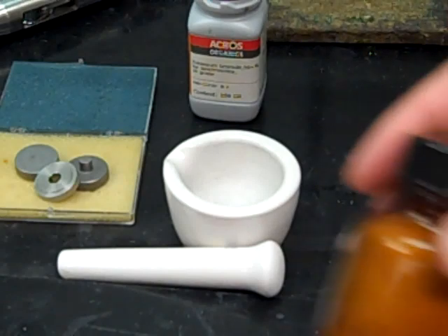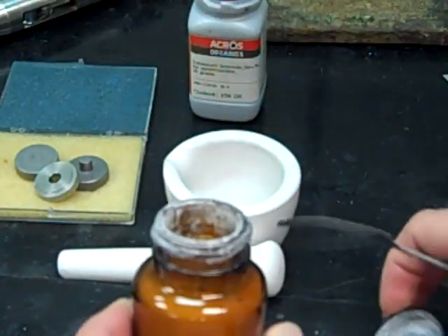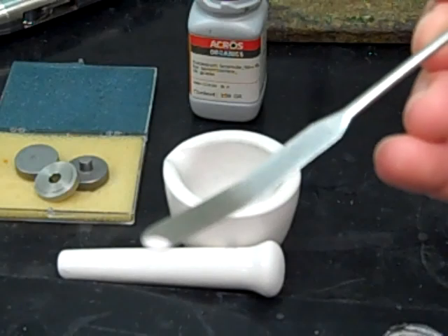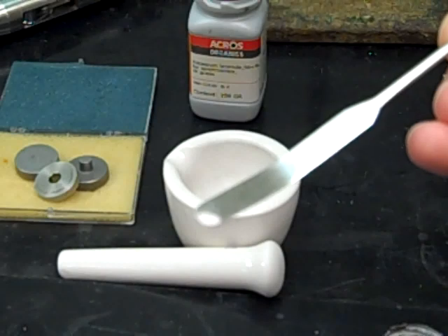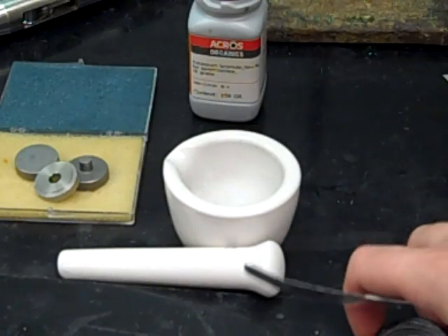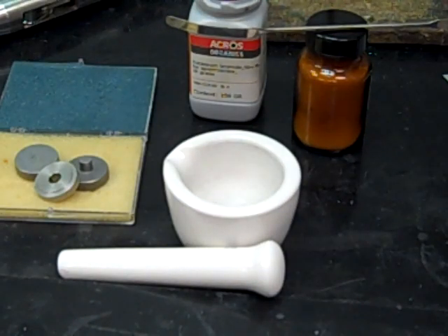From there, you're going to add your sample, which for me is salicylic acid, like I've said. For your sample, you're literally only going to need just the tip of a spatula with that material. You can see that on my spatula, just barely what would be a milligram or 2, the tip of my spatula full of solid. And I'm going to put that in as well. If you don't have the right mix of KBr to your sample, it can end up making the pellet too sticky, and then it's tough to get out of that pellet press.